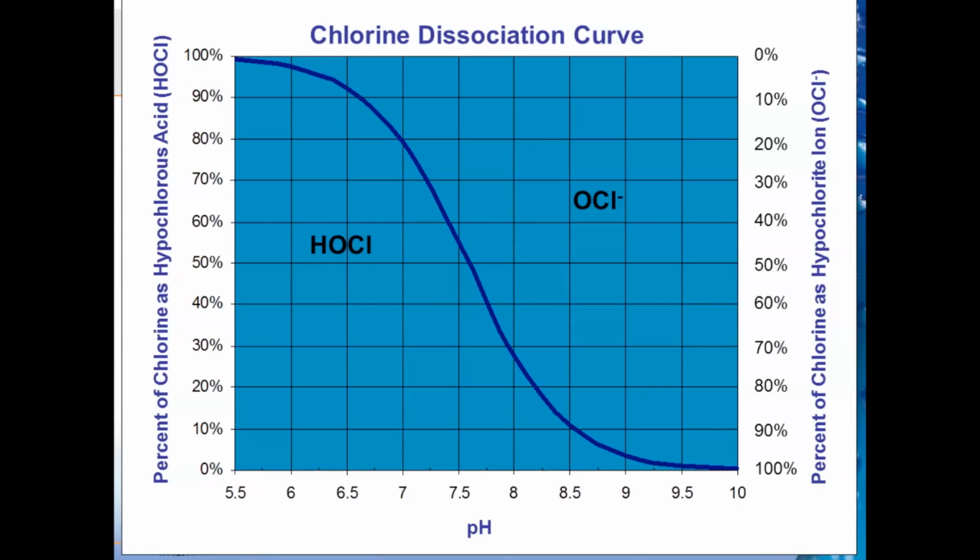With our sensor, we're going to do that mathematically. We actually have to install a pH sensor, measure what the pH actually is, what we're reading as far as HOCl, and then we adjust it mathematically to try to match what the test kit is going to read. And we have to do that because this test method has been around forever. People don't really care about those parameters sometimes. They just want it to match. So to do that, we do it mathematically inside of the controller or analyzer.